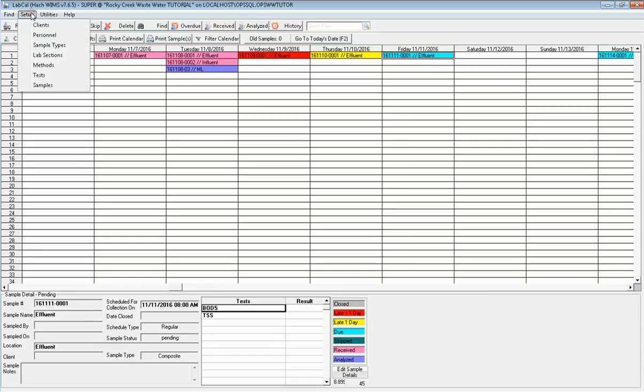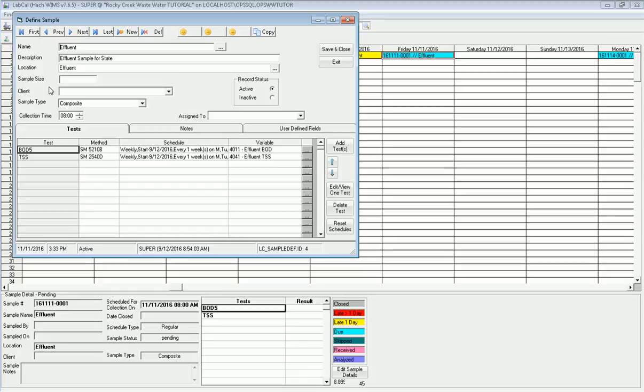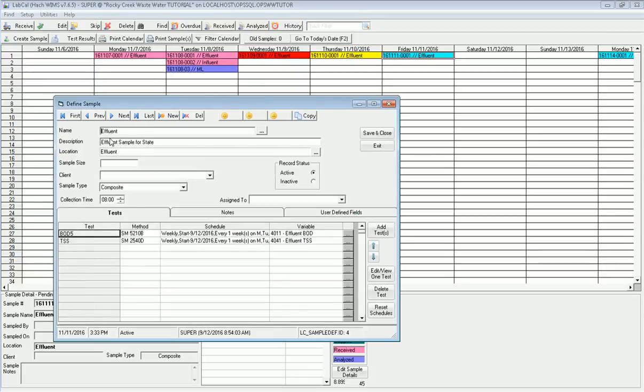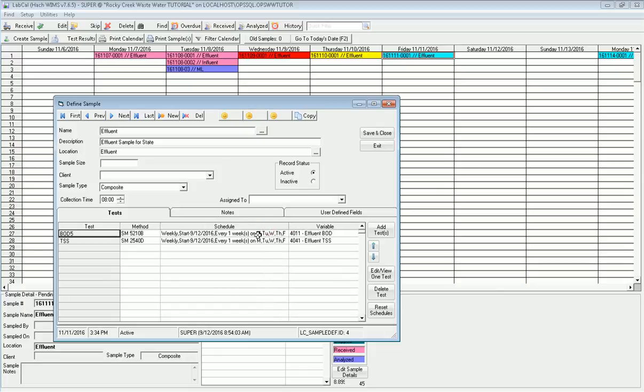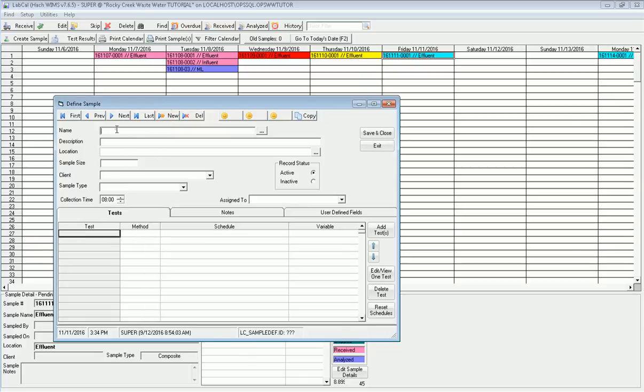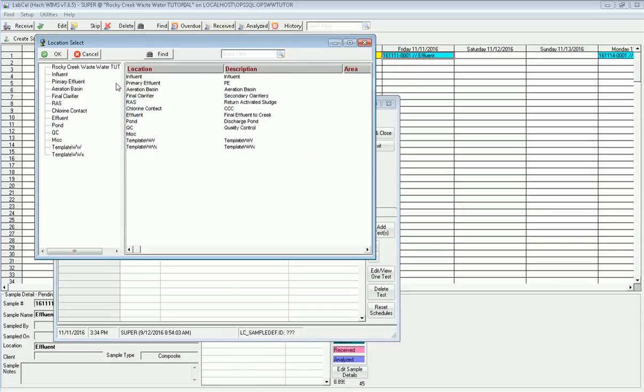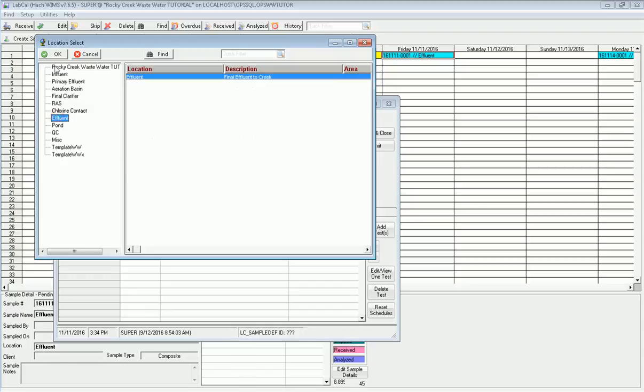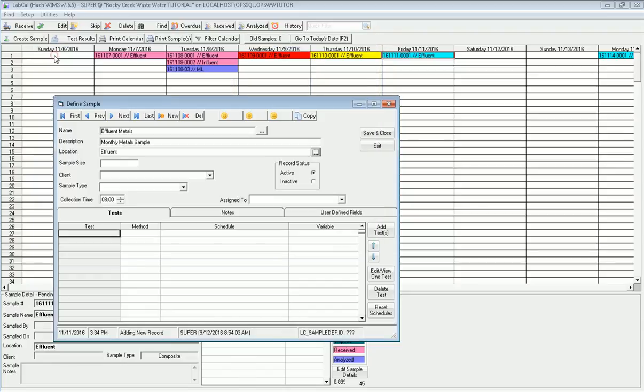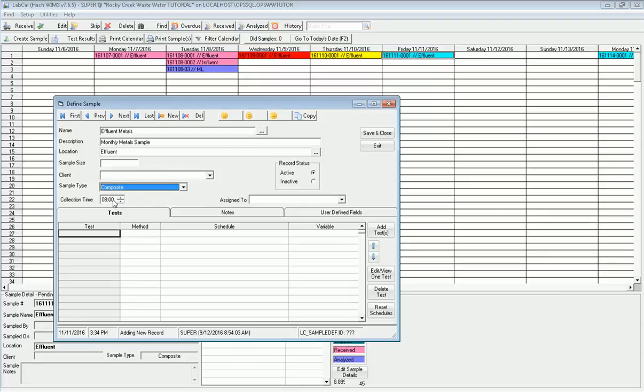Now I'm ready to schedule my sample. I'm going to go to setup and samples. It comes in and shows me I've got this effluent sample already set up that has my BOD and TSS. That's the one you see. The schedule here says it's on Monday, Tuesday, Wednesday, Thursday, Friday, so it's on the weekdays. In this case, I'm going to set up my new sample called Effluent Metals. I click new, type in Effluent Metals, give it a description: my monthly metals sample. I choose a location from my WIMS setup. What location is it going to be pulled from? I choose Effluent. I'm going to say this is a composite sample type. I usually collect it at 8 a.m. Sample size, you can fill in with whatever you want. In this case, there is no client.